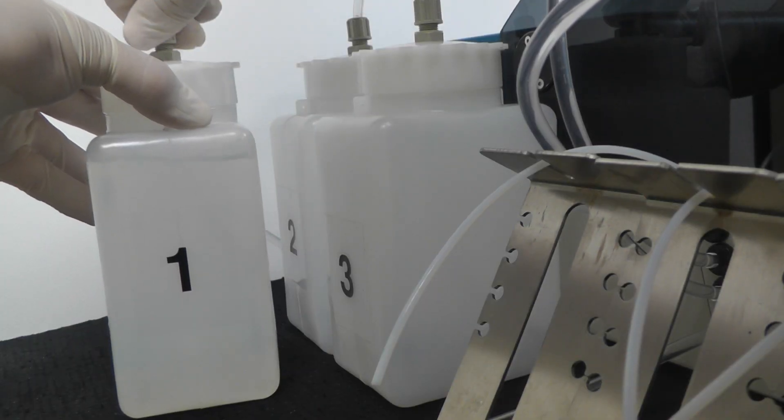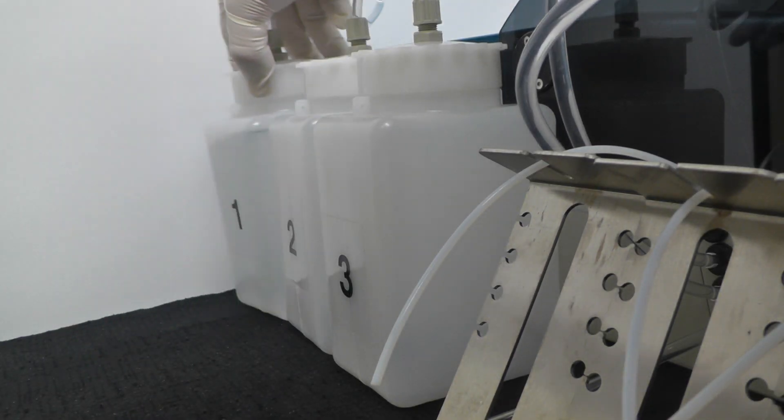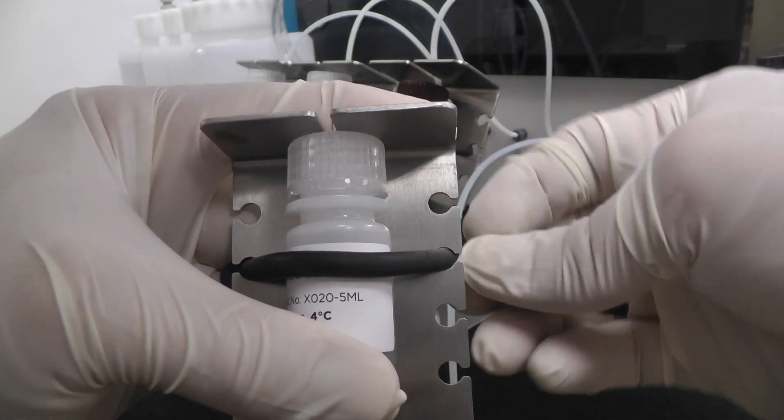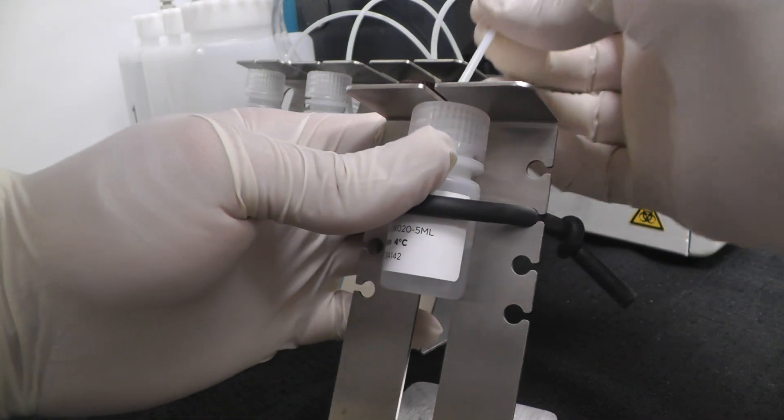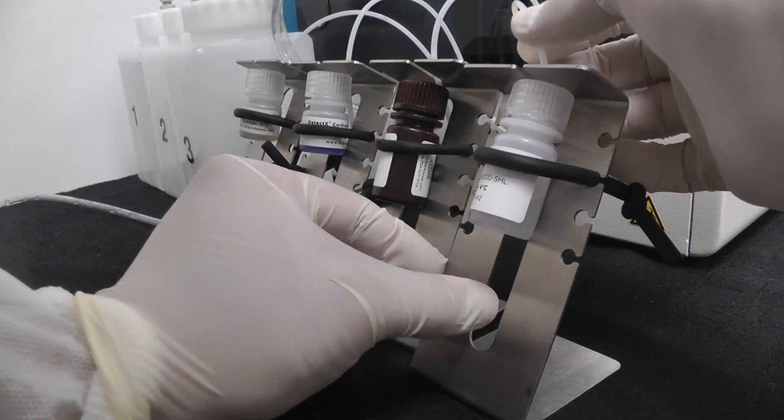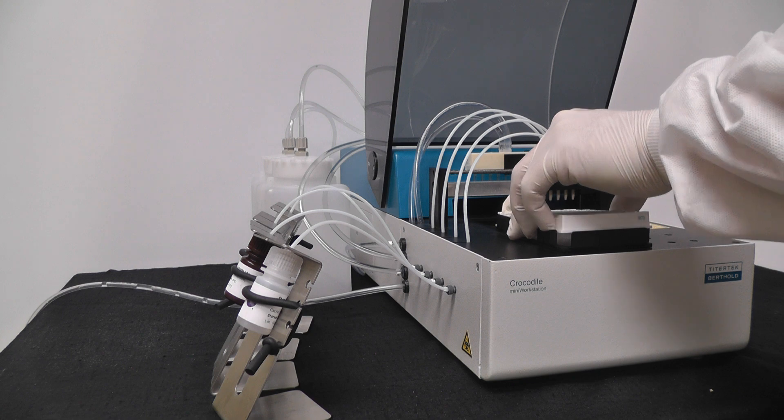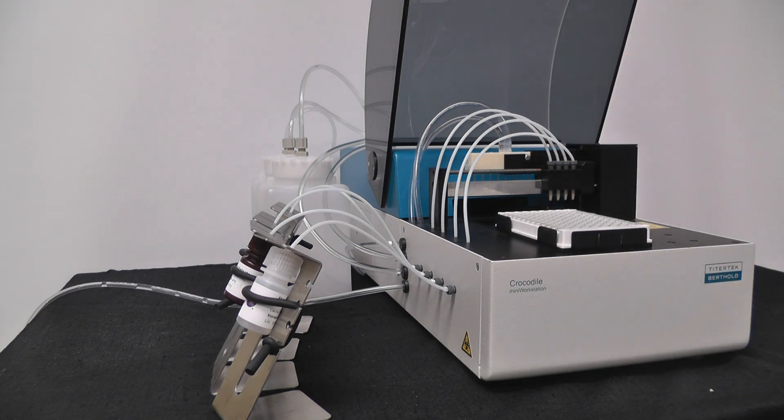The Crocodile Mini Workstation is prepared by connecting the wash connection to our prepared wash buffer. Then, the provided reagent bottles are connected to each of the small volume dispensers. Now the Crocodile Mini Workstation is ready to start.